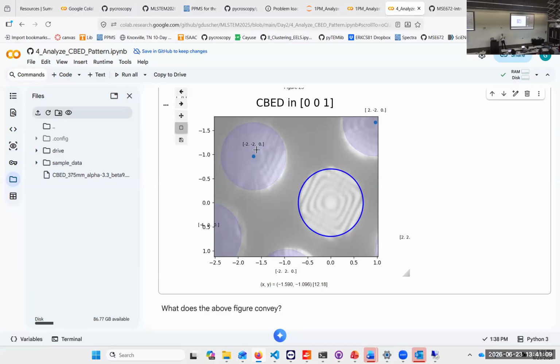You want to reduce that. All you really want to know is where are my spots, right? So you can find those spots fast with machine learning tools that were trained on your diffraction patterns that we simulated at this point in time, or with a blob finder. Any of that would work. If you do it with more information like we have here, it's getting significantly more difficult.